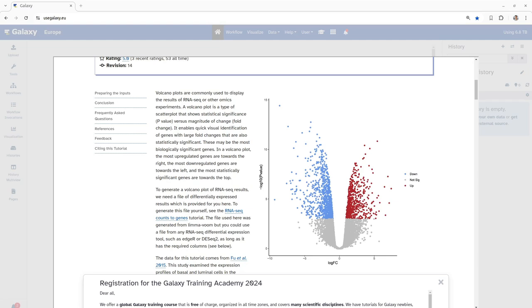For this tutorial we will be using a dataset from a study conducted by Fu et al. in 2015. This study analyzed gene expression in basal and luminal cells of the mammary glands of mice during different physiological states. We will be using a differentially expressed result file to generate our volcano plot. This file was created using the limma voom but similar results can be obtained using other tools like DESeq or DESeq2.